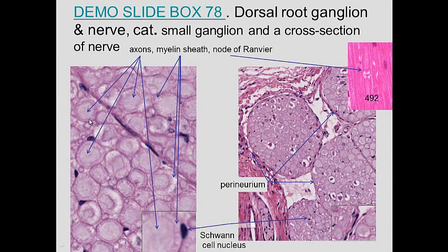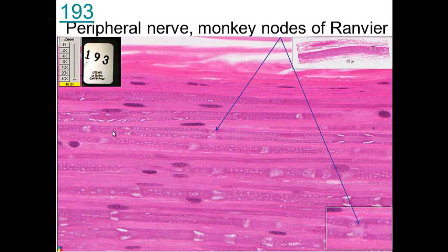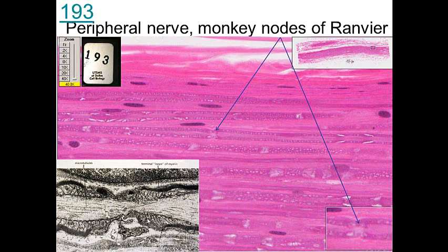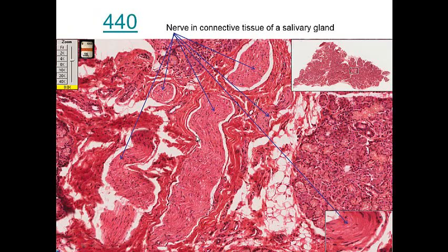In this cat we can see the myelin sheath, and the gray areas are the axons — some of them quite big. This is the perineurium around the nerve; endoneurium would be on the inside. If we look at the longitudinal view of the nerve, we can see one Schwann cell and another Schwann cell has myelinated this axon. We see some fibroblastic cells in there, some of which could be Schwann cells as well. The node of Ranvier is different from the Schmidt-Lantermann clefts which run at an angle — this is where the myelin sheath Schwann cell swirl ends and another one begins along the length of that axon.